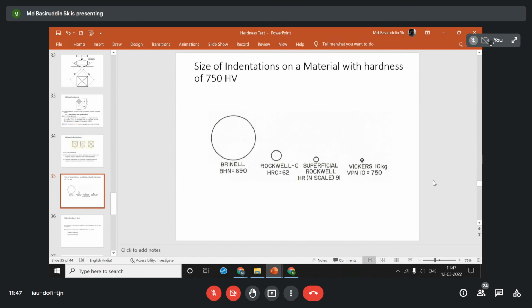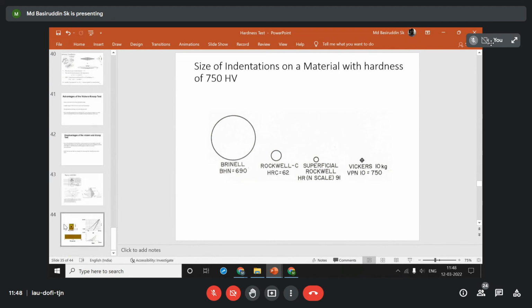Another thing that can be carried out is if you want to check how the deformation is happening, like how the ferrite is deforming depending upon load. That can also be checked by nano indentation testing or micro indentation testing. In this case, what we try to find out is the load versus displacement curve, the load versus displacement data. I will show you in a later slide.